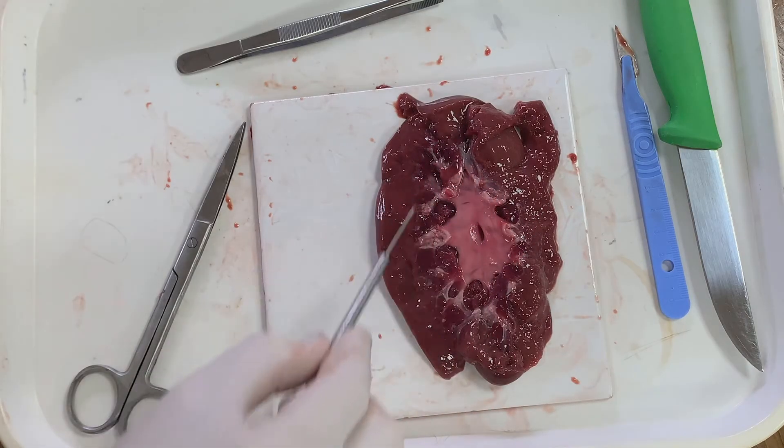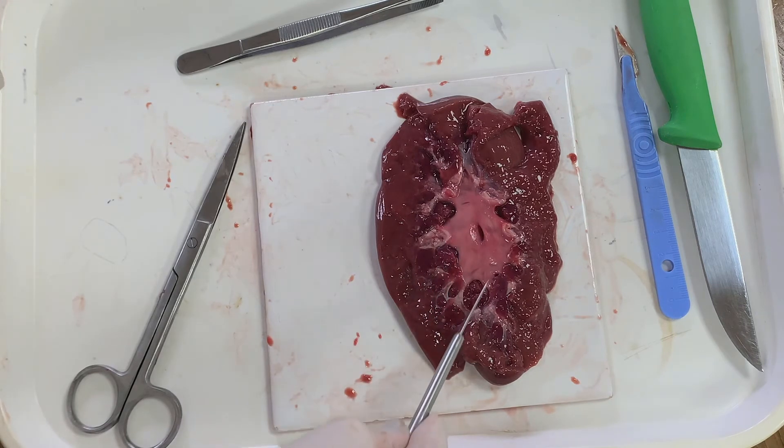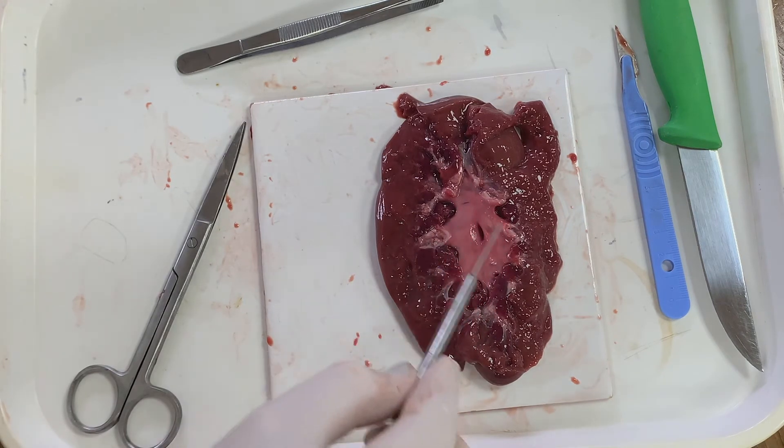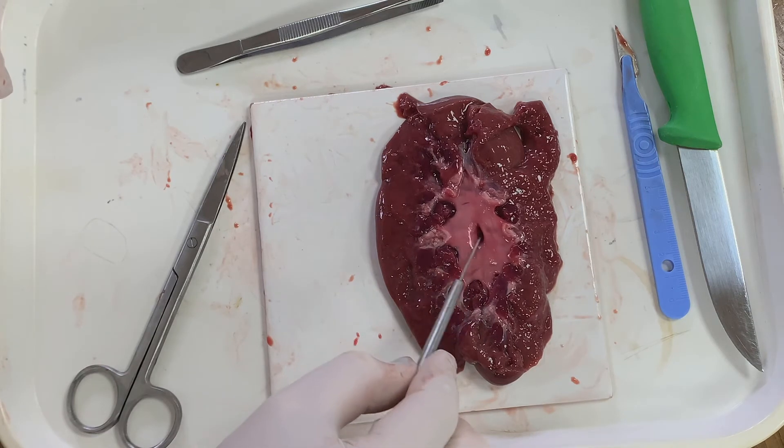On this kidney you can see the browner cortex around the outside, then the medulla with the red pyramids separated by the calyces, which lead down into the pelvis. Finally, you can clearly see the ureter in the middle.